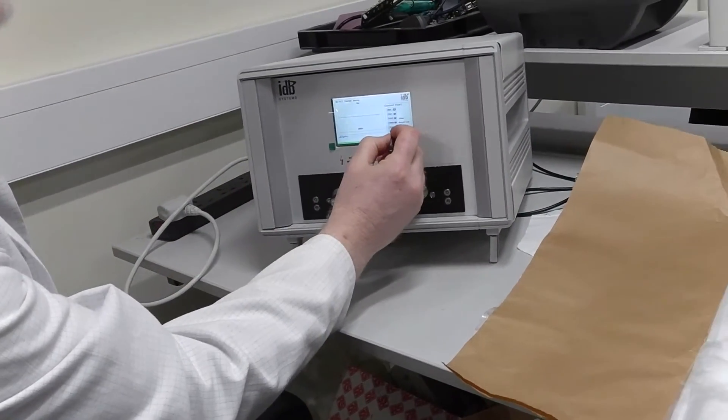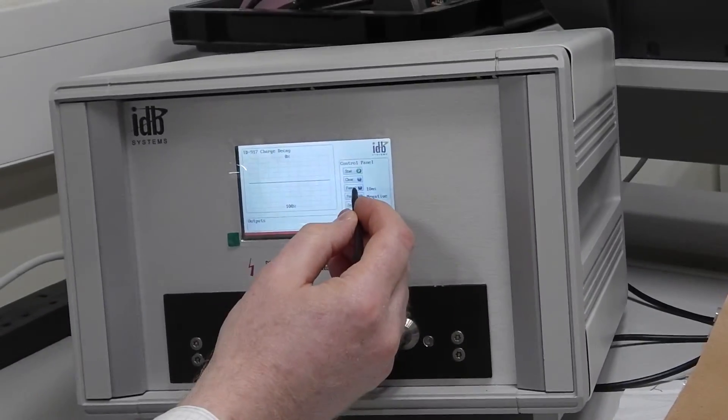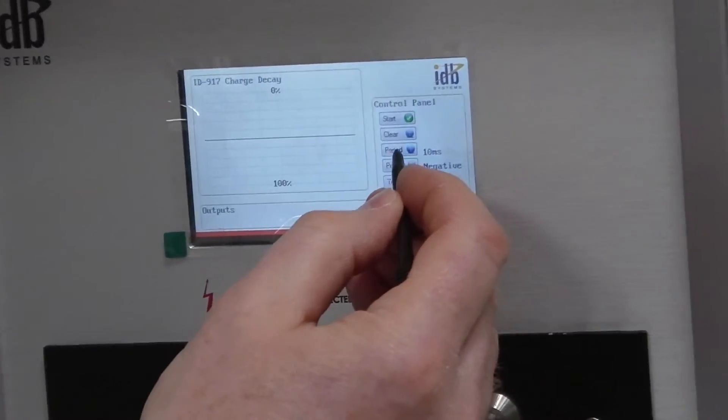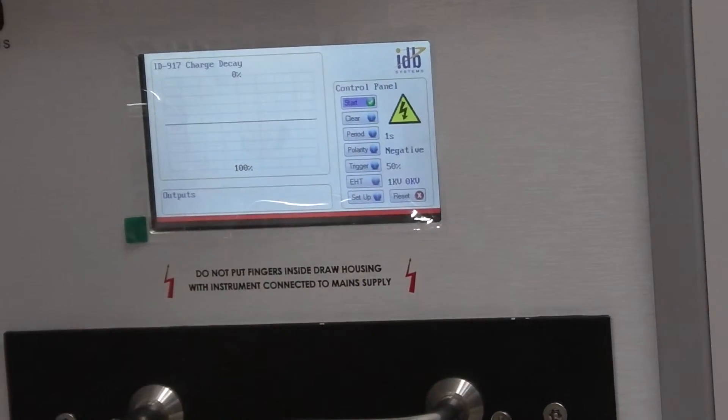Set the EHT voltage back up to 1 kV, 50% trigger point and negative EHT again, and a period of one second. So we'll start it there.